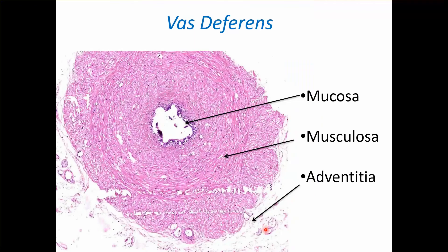Again, vas deferens. The mucosa is pseudostratified columnar epithelium with stereocilia. There are three layers of muscle: inner and outer longitudinal, middle circular, and the outermost is adventitia.